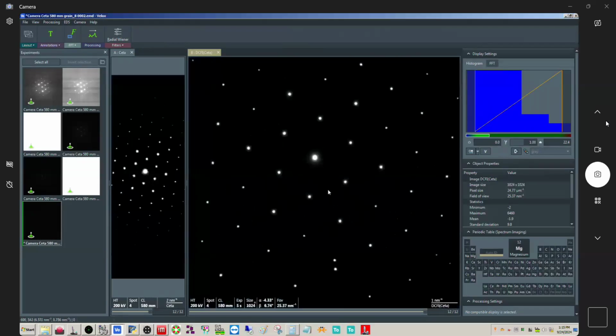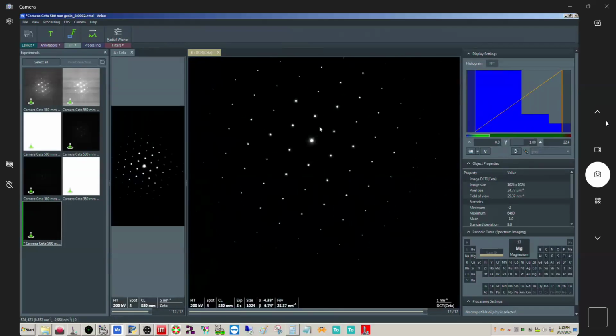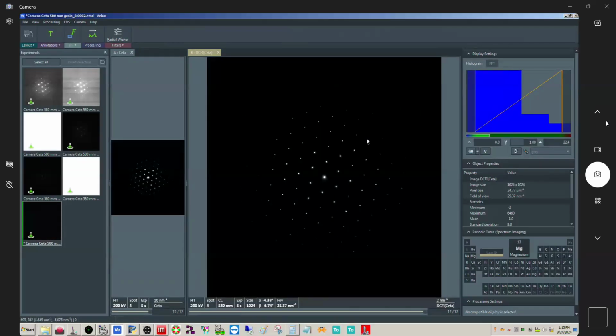So, but that looks good here, okay? And again, nice and safe, right? We're under our max, so no issue here, okay? So again, this is safely recording the patterns.